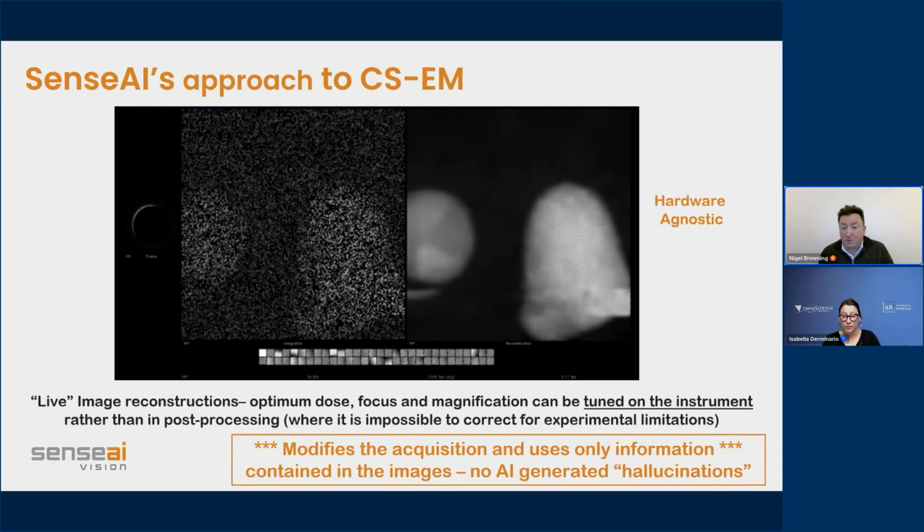Now, we haven't specifically tried to do it with different charging or beam levels, because essentially when you go to sparse sampling, you're not changing the resolution of the microscope, you're not changing the magnification that you're working at. The only thing you're really changing is the dose and the dose rate that you're putting into the sample. So it's pretty easy to identify that as a charging effect.